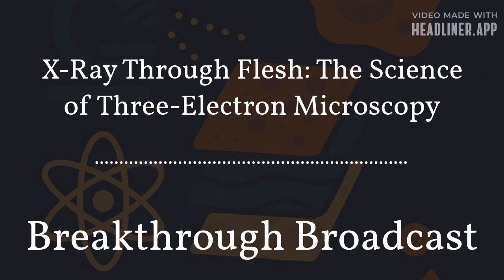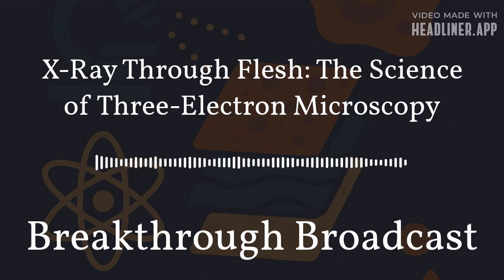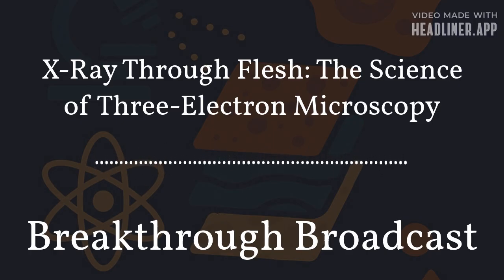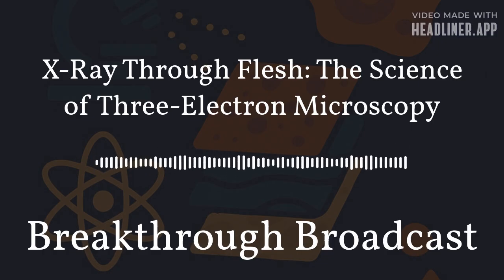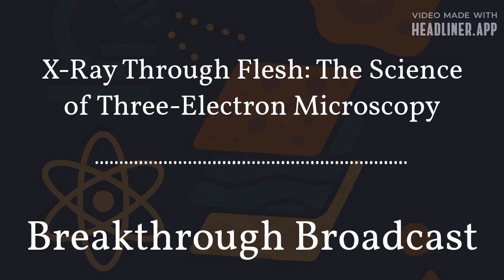Before diving into how the method works, it helps to understand the foundations of electron imaging. Electron microscopes function by directing a beam of electrons at a sample. When the electrons interact with the atoms in the tissue, they behave in several possible ways, depending on the energy of the beam, the structure of the material, and the arrangement of the electrons inside the atoms that are being hit. Some electrons are ejected from the surface of the tissue after being hit by the electron beam. Some reflect backward after colliding with the tissue, and others pass through the sample altogether.